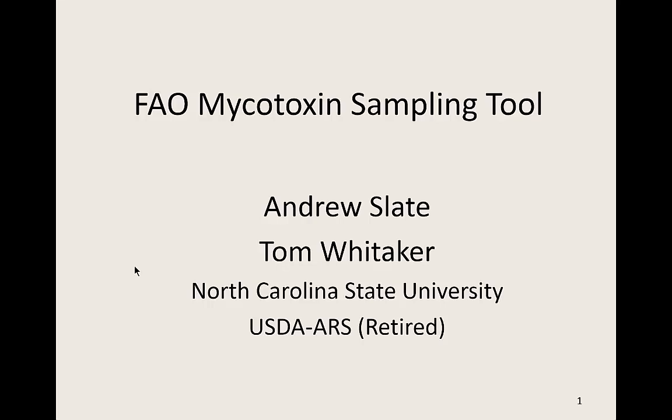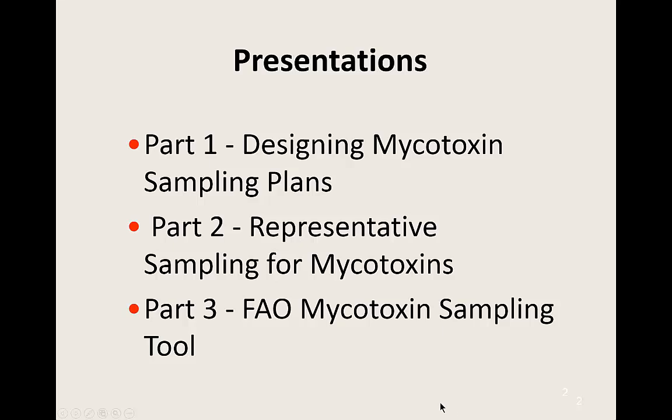This is the third and final presentation of our three-part series on mycotoxin sampling. In this presentation, I'd like to present the FAO mycotoxin sampling tool. So far, we've seen two presentations. Dr. Whitaker presented designing mycotoxin sampling plans in part 1, and I presented representative sampling for mycotoxins in part 2.